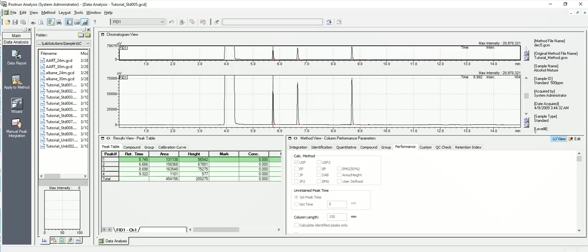So again, the other thing that you want to do for sure is after you inject the sample once and you get something that looks reasonable like this, inject a second time just to verify that the retention times aren't shifting over, all around. You want to make sure consistency is very, very important.